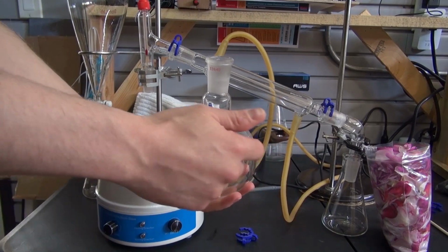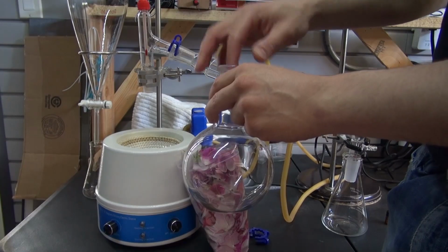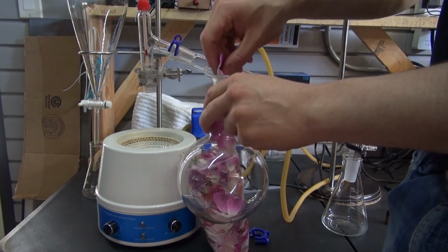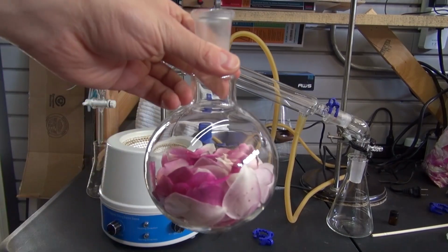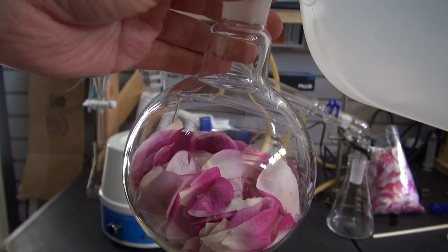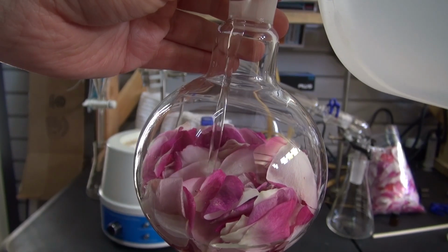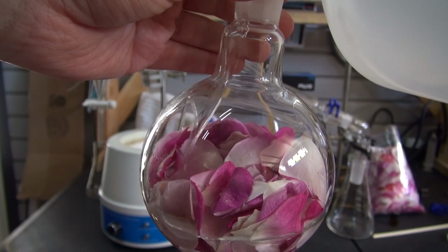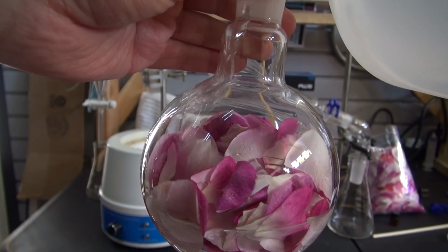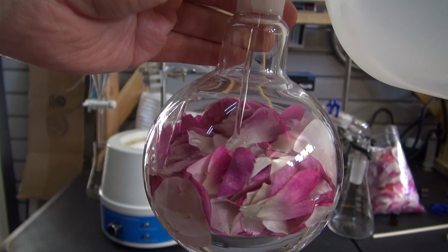Next I'm going to get my Florence flask and fill it up with rose petals. Pick up 3 or 4 rose petals and stuff the Florence flask, just like this. Next I'm going to get some distilled water and fill up the Florence flask about half. About halfway full, just like this.